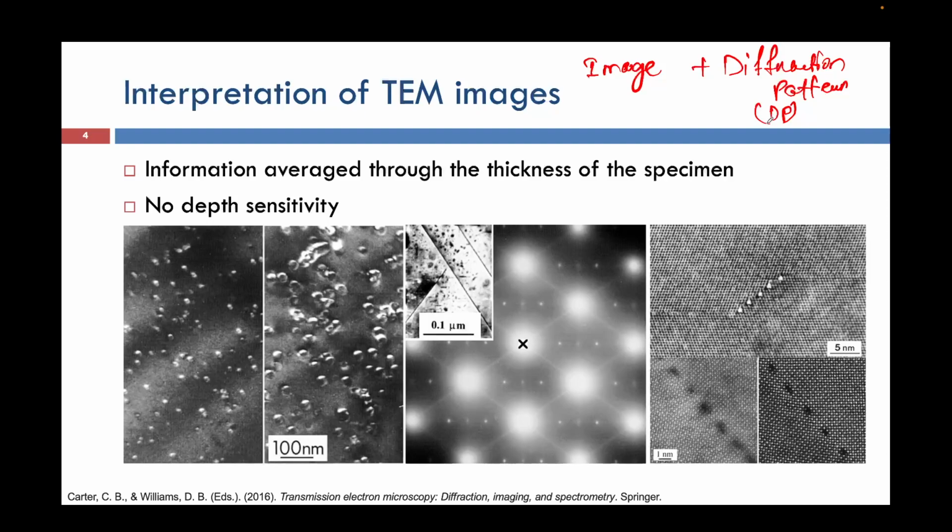So these are the different types of information that I will get from a TEM machine. As you can see, this is a TEM image of the material, I think strontium titanate. Here you can see there is a twin boundary associated with it, and all the dots that you are seeing are nothing but the atomic columns. Why am I saying atomic column?